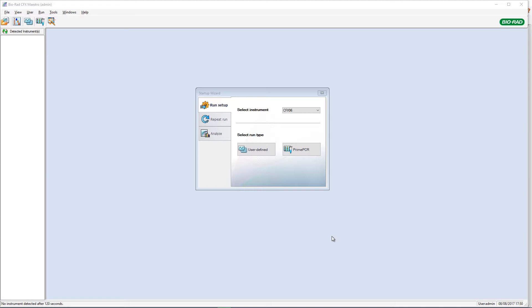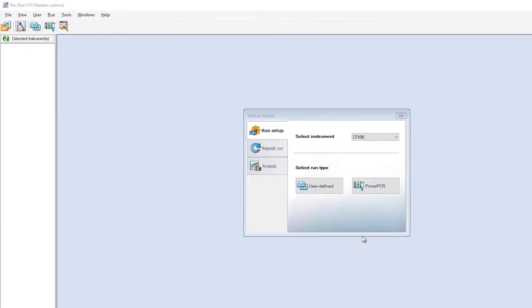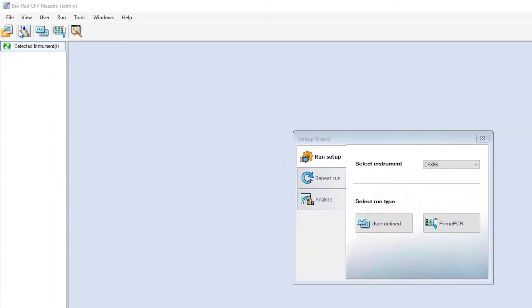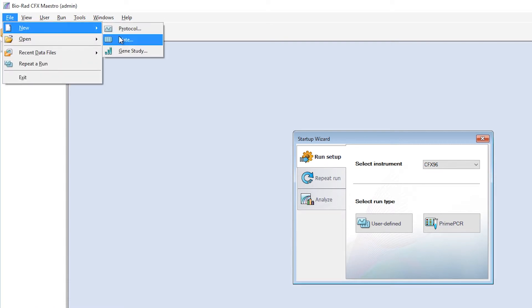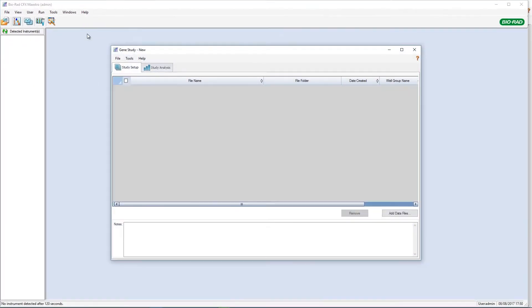The Gene Study Module allows you to analyze a single plate or combine multiple plates for analysis. To create a Gene Study, select File, then New, then Gene Study. You can now select one or more complete run files to add to the Gene Study by clicking Add Data Files.